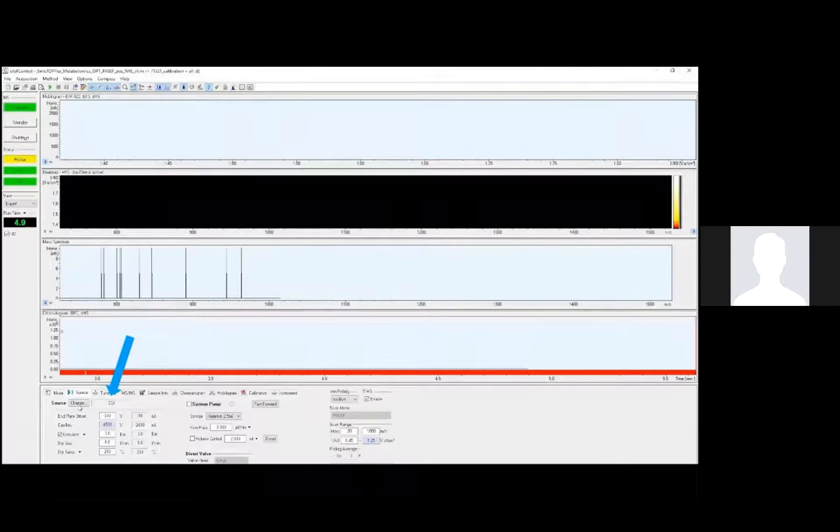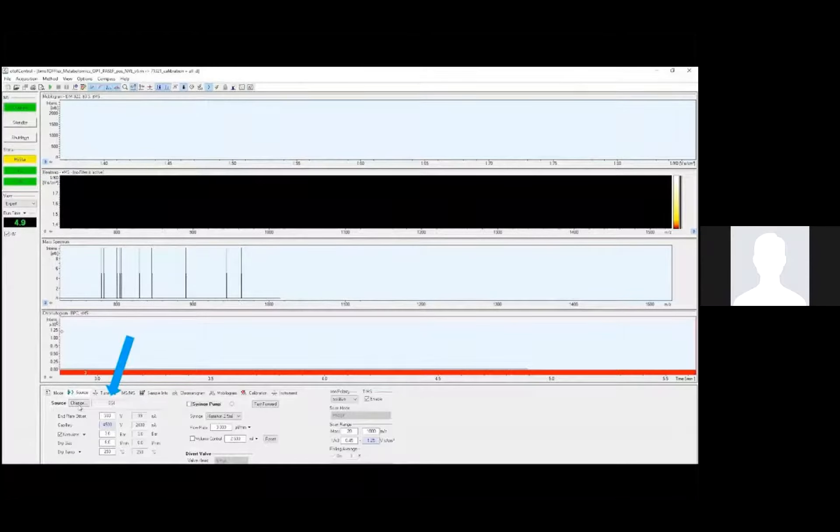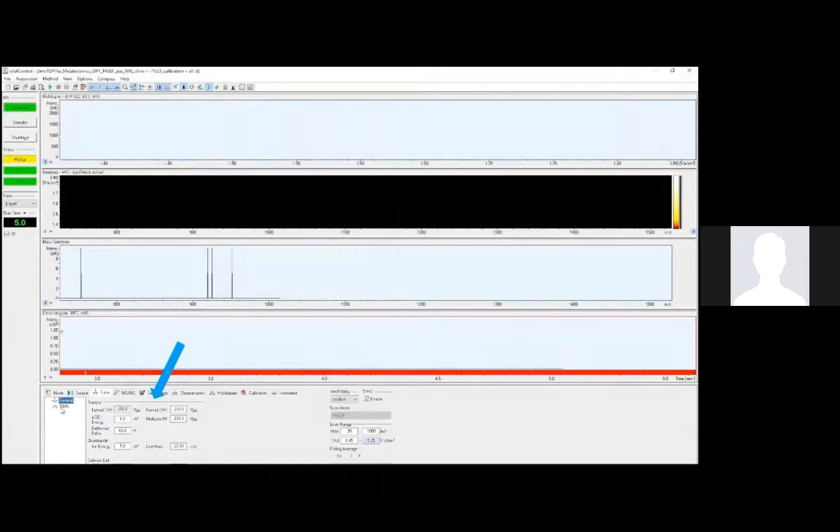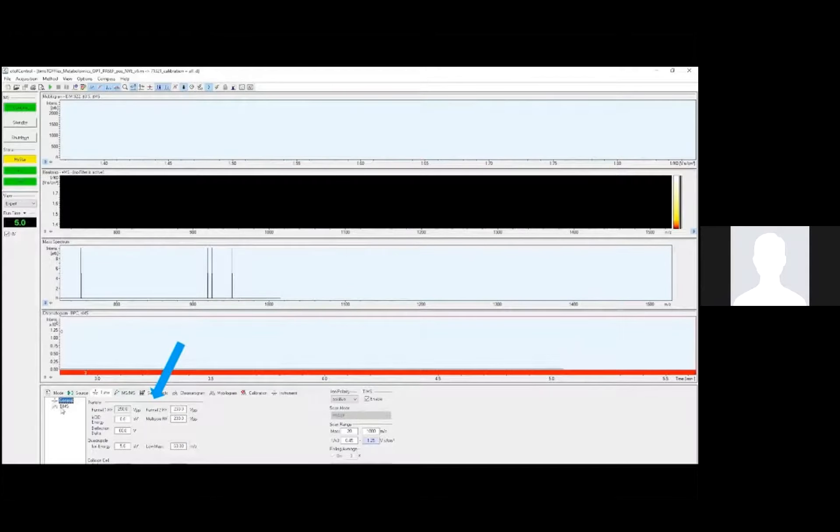Under the mode tab and then TIMS, we can also set the 1 over K-naught range, as well as the ramp time and some other TIMS-specific settings. These source settings are very important. The nebulizer, dry gas, and dry temperature must all be set appropriately depending on the flow rate set in the LC method, and that gives you the ideal ionization from the ESI source. It's also here that you can change the source type if need be into nano ESI, and we can also turn on or off the syringe pump here as well as control the switching valve settings.